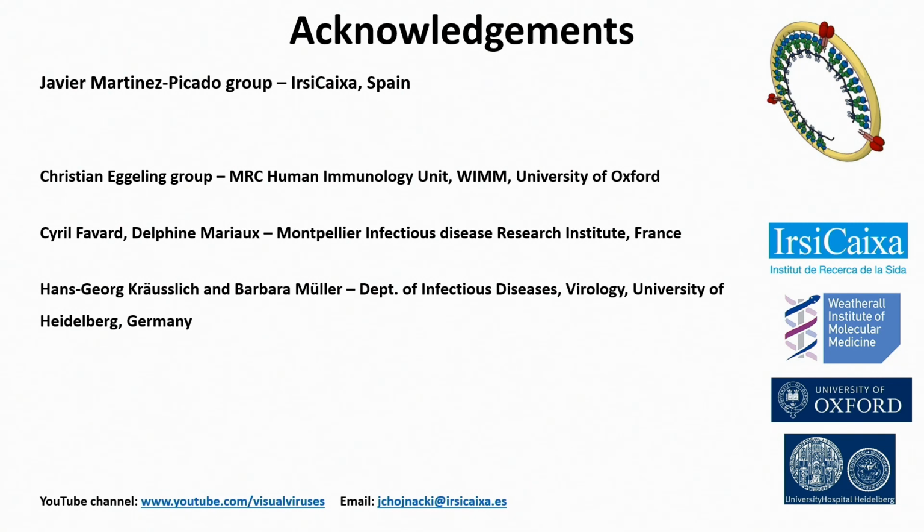And have you done these studies with SIV? No. The thing with SIV is that it paradoxically has quite a lot more ENVs on the surface, I think only when it's truncated. Sure, true. But that's why we focused on HIV: in the early studies of superresolution microscopy, we were very happy to have only a few molecules of ENV. If you have more molecules of ENV, at some point you lose the clusters and just get a ring, like if you image SARS-CoV-2, you would get a ring of all the spikes around and would not be able to look at clusters. Yeah, but a wild-type SIV also has about seven spikes. Sure, so you can do the same. We just didn't get around to it. In this case, we simply focused on HIV.